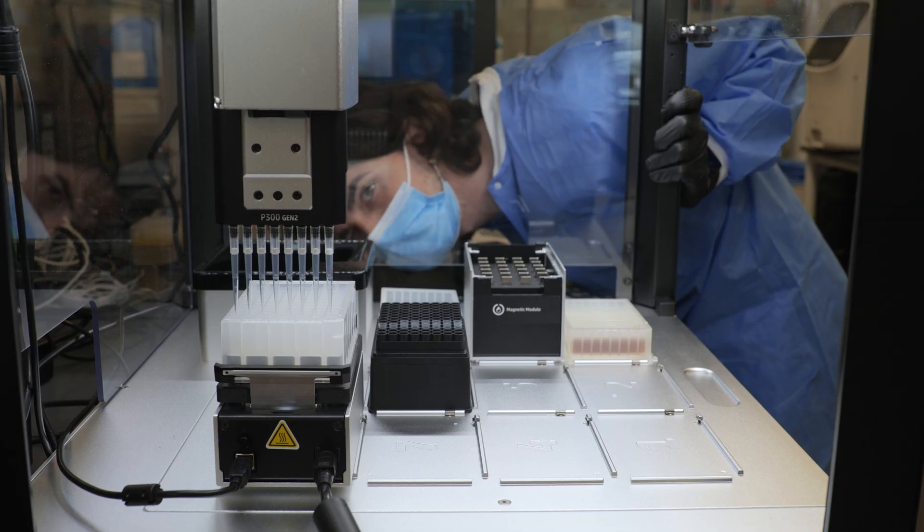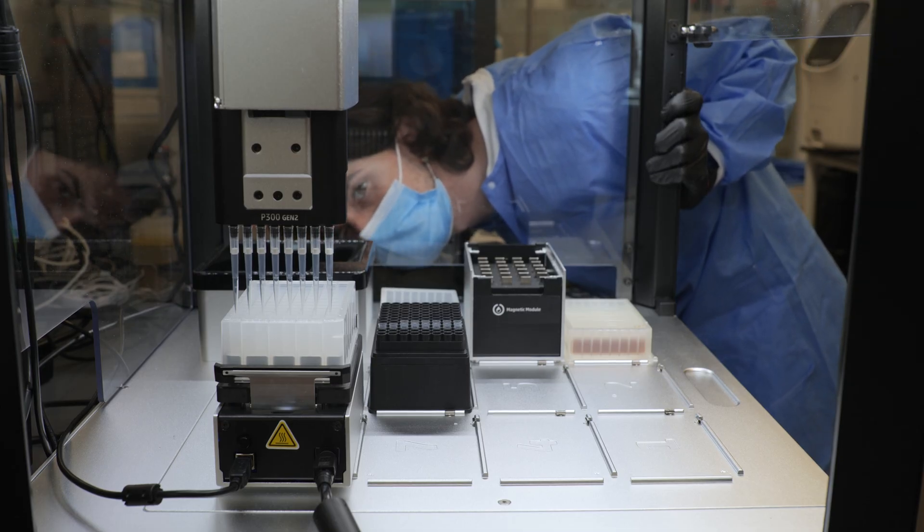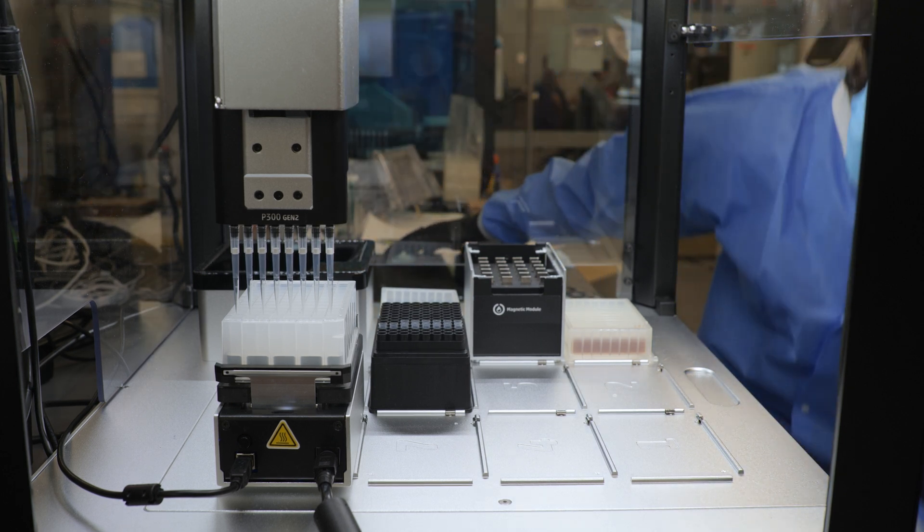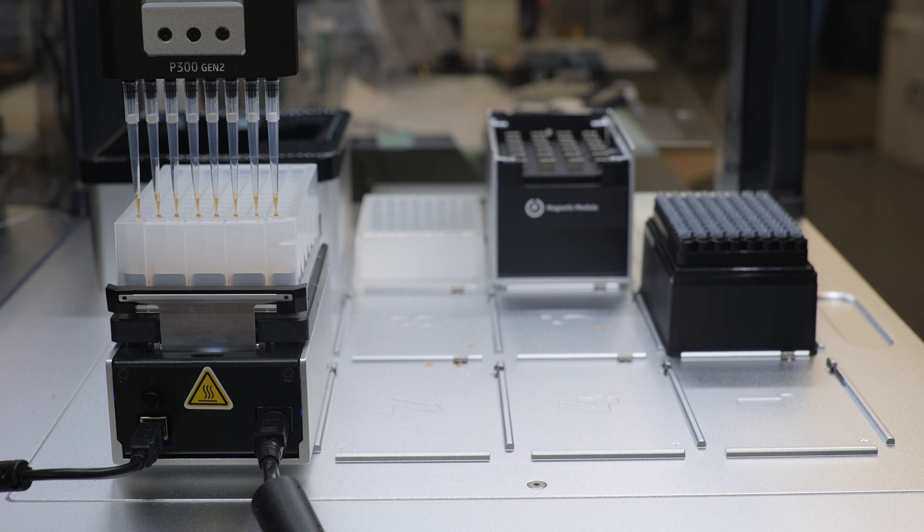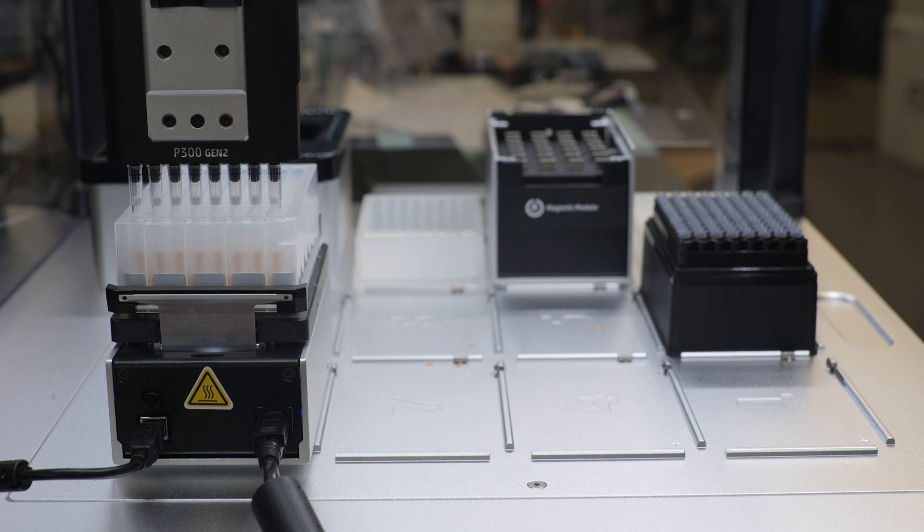Calibrating your Heater Shaker module is similar to any other Opentron's labware setup. You simply adjust the robot's positioning and save it for the first well in a piece of labware, and then it knows where all the other wells are.